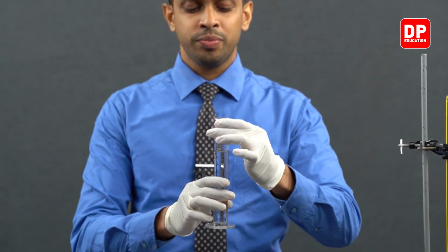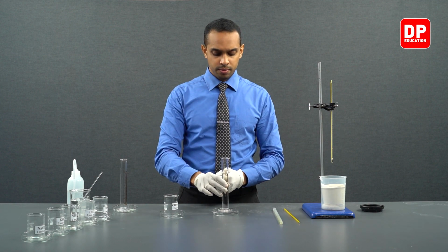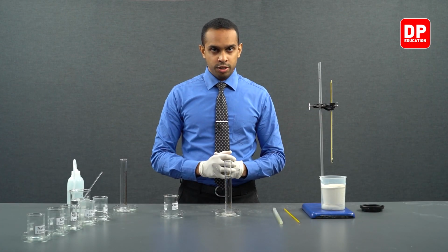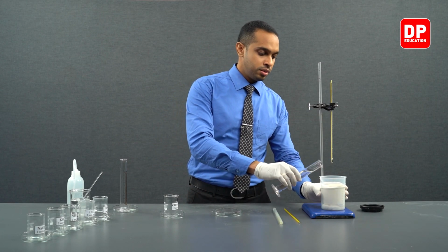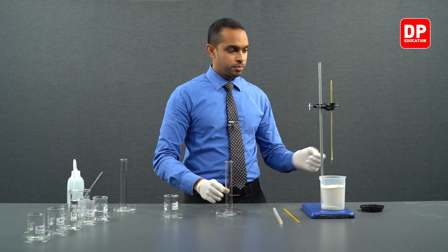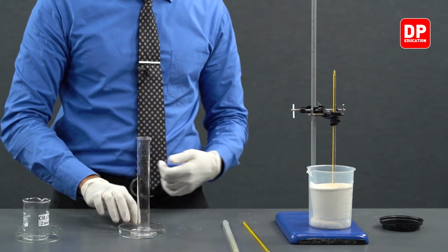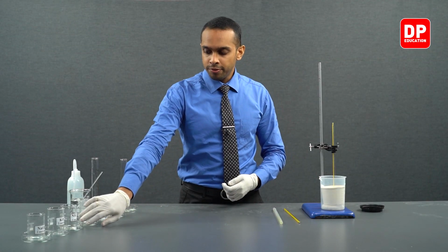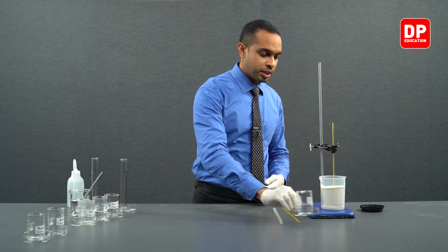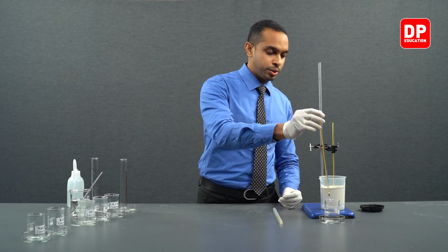So we have measured 50 milliliters of ethanoic acid, and now after measuring 50 milliliters of ethanoic acid, we are going to transfer it into our plastic beaker here, and we'll get the temperature of this ethanoic acid. We have our ammonium hydroxide solution here. We are going to measure the temperature of the ammonium hydroxide solution right next to our ethanoic acid solution.